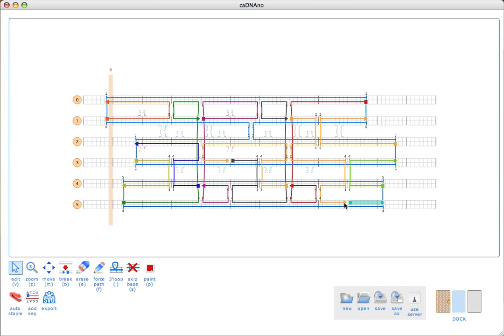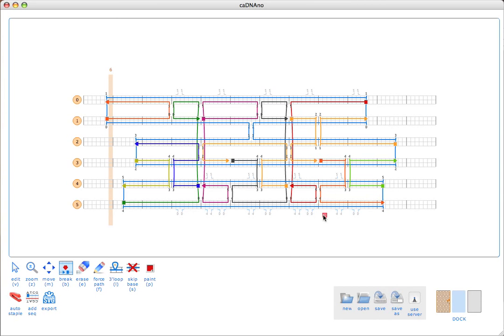We have one more down here, and now this one is too long. So we'll just add a break right there. All right, so now we have our staple paths and none of them are highlighted.